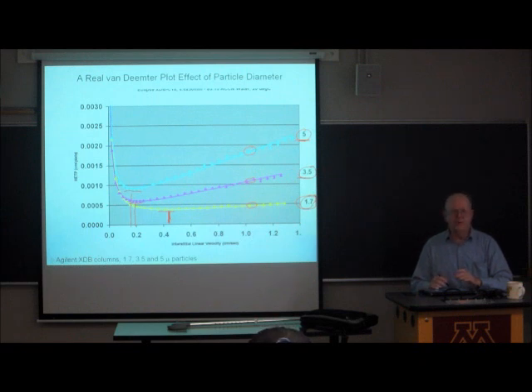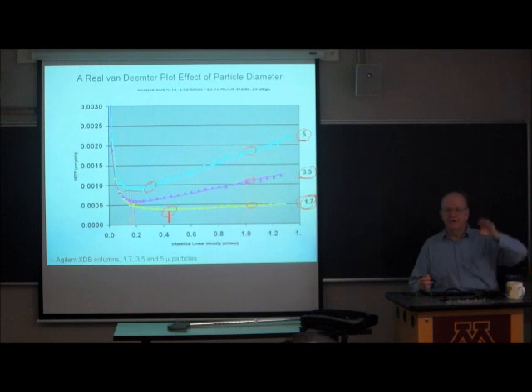This column works perfectly well with a 400 bar system, and this one needs a 1,000 bar system to make it work. A pump that cannot leak fluid when you apply 1,000 bar to it is a lot harder to make than a pump that only has to handle 400 bar. And that's the bottom line why it's taken that long. It took us 20 years to get from 10 micron particles to 5 micron particles.